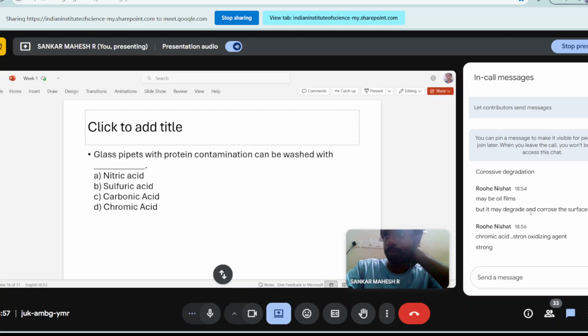How to make chromic acid? Because chromic acid is not usually present. Rather, you would add a couple of things. Laboratories use them for cleaning these things.